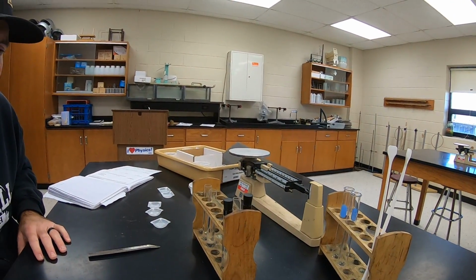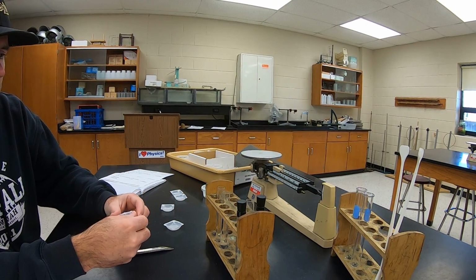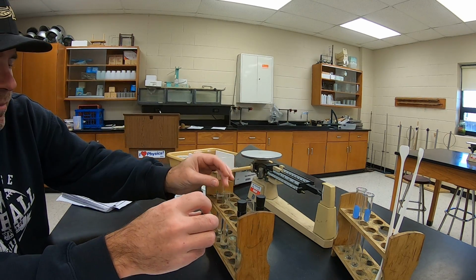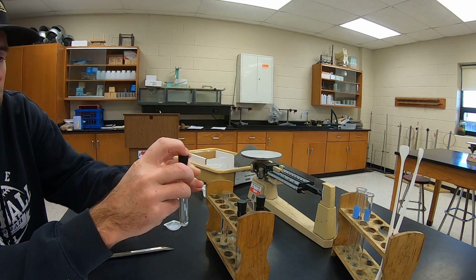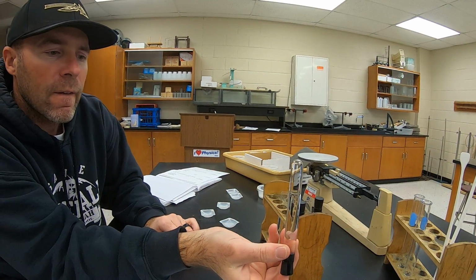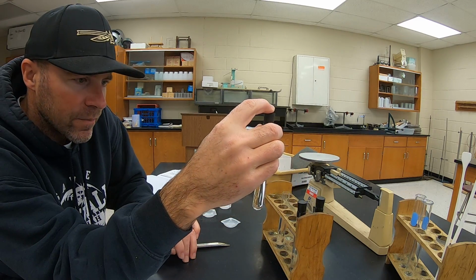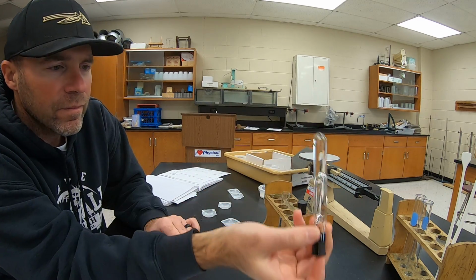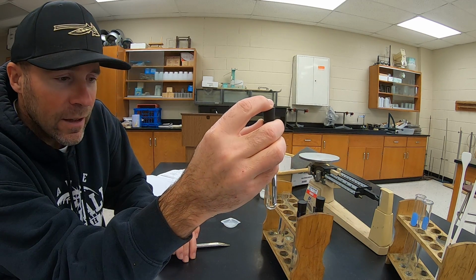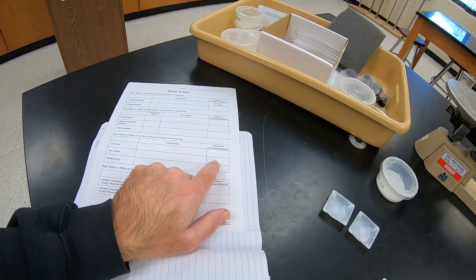We know the first test was 3, and the second test was, I think, 4 inversions. So we'll do the same thing. Pour it in. Let it settle to the bottom. Let's count the inversions here. 1, 2, 3, 4 is what I got this time for the regular salt. So back over to your table. For salt crystals, put 4.